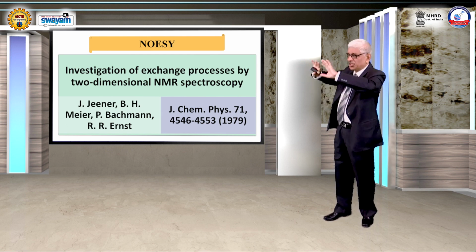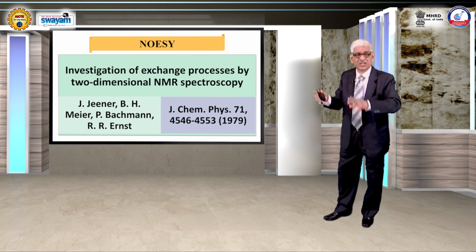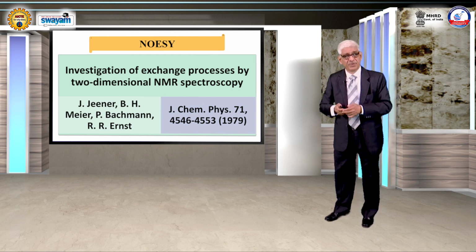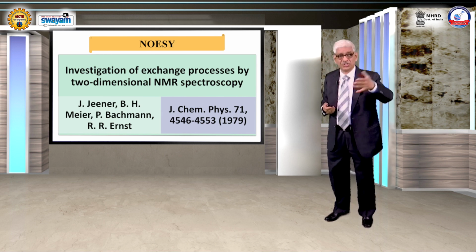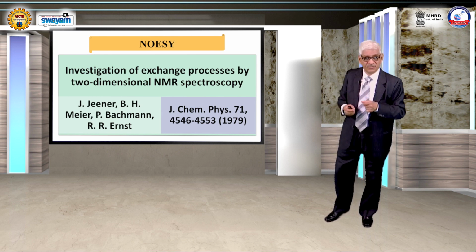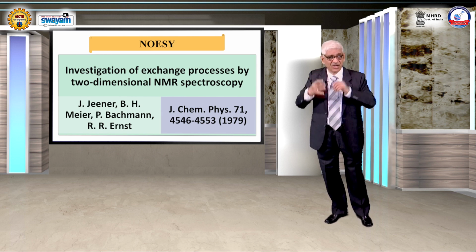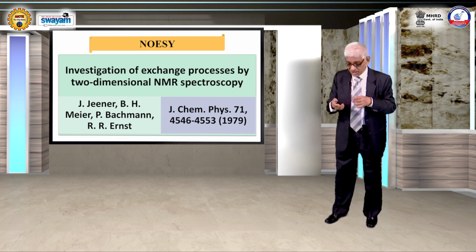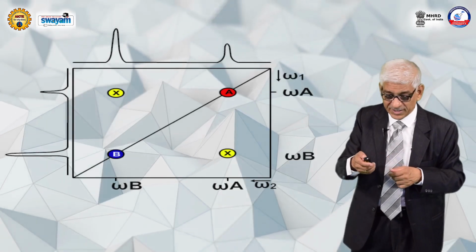If the molecular structure changes, the distance between the two protons changes, and this was actually a major development. It led to the application to protein structure determination in larger molecules, and so on. In fact, as I told you, that led to another Nobel Prize, to Kurt Wüthrich in 2002.